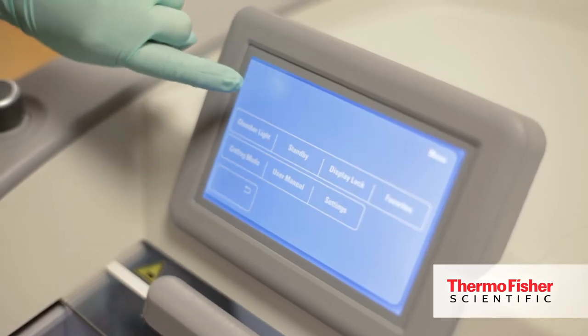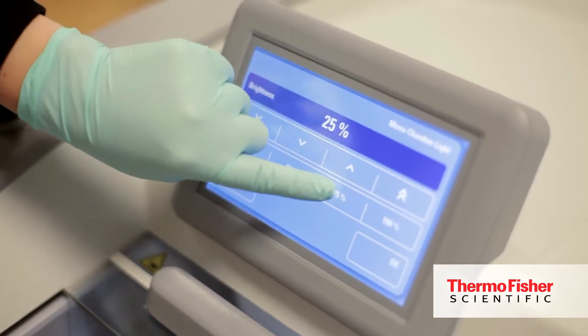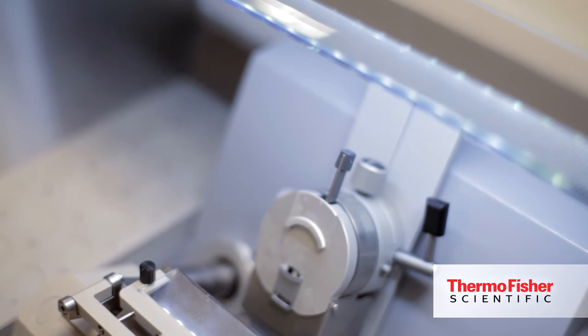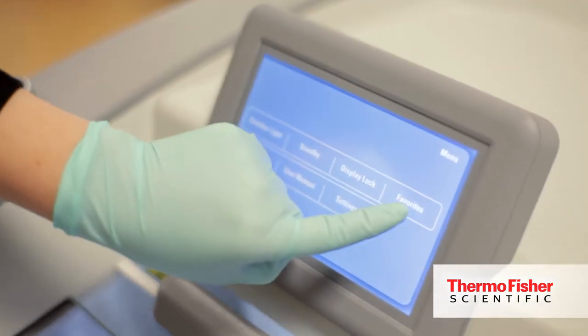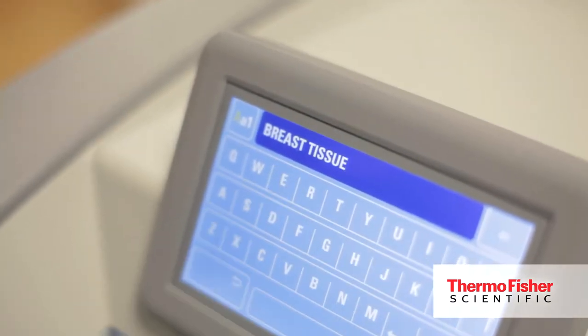There are different features on the touchscreen that enhance the user interface, making it much easier for new users to step in and use the instrument. It also allows users to save presets. With the touch of a button they can easily become very familiar with this new instrument and the new settings we're offering, such as rapid temperature control, which allows the user to specifically set temperature settings for the type of tissue they're going to be sectioning.